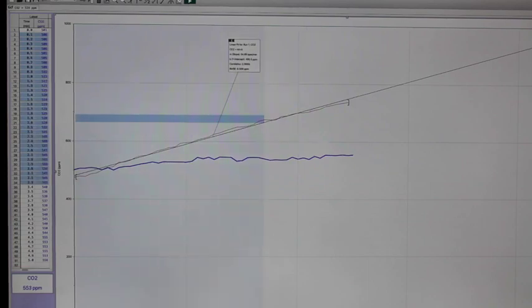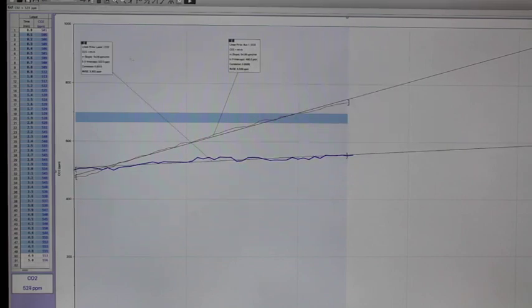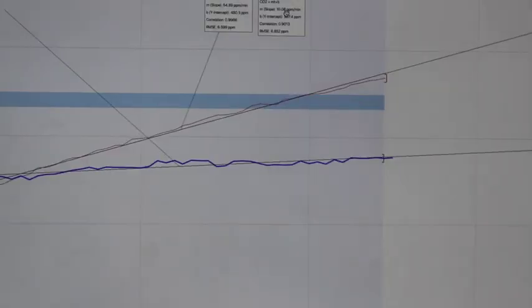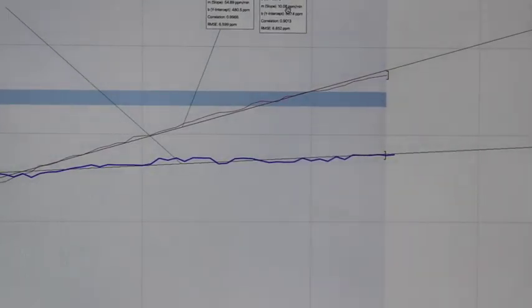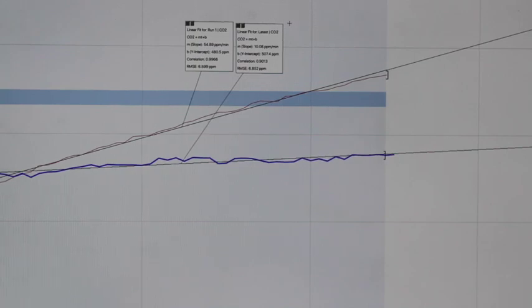Ultimately, then we're going to run statistics to see how we want to evaluate this. So I'm going to highlight that. We'll click again on the best fit line. I really only want the latest run because I already got the best fit line for the earlier run. Grab that, and then I'll move that right next to that one. Okay, and then we'll zoom in as far as we can, and I'll move both of these down just a teeny bit so that you can then see that slope on there.